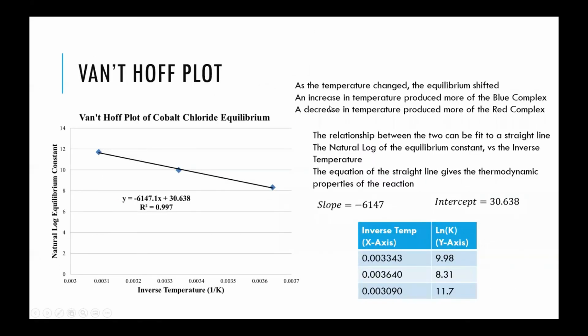So you can see how the temperature, or the energy of the environment, can affect the equilibrium. You can see that in the changing of the color, going from the equilibrium purple, where the 2 different complexes are nice and balanced together, and you increase the temperature, it goes more blue. You decrease the temperature, it goes more red. The temperature plays a critical role in the equilibrium. And because of that, you can relate the two large concepts in Chem 2, equilibrium and thermodynamics, based on the energies.